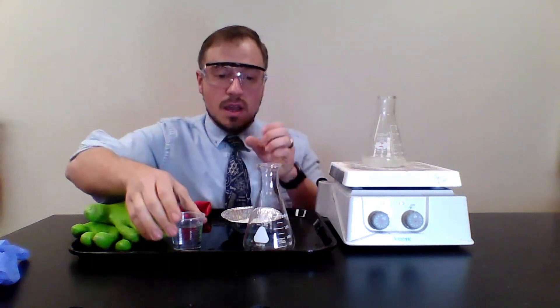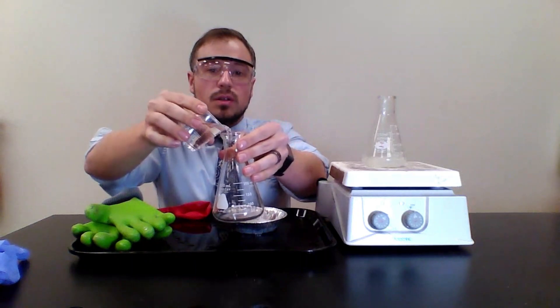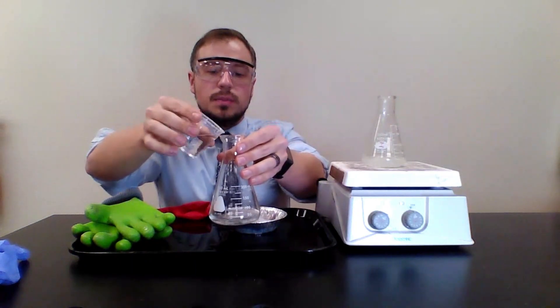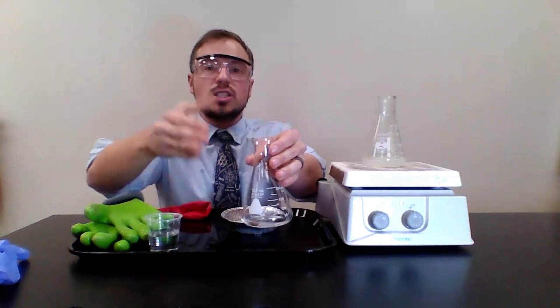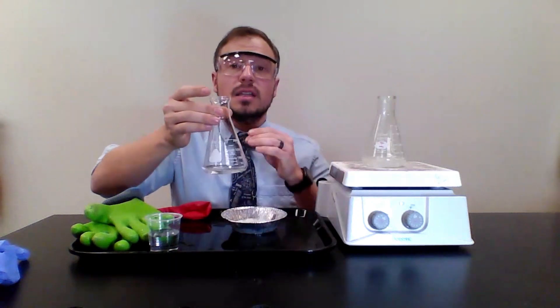First step: turn on your hot plate up to 10, as hot as it'll go. Then take a little bit of water and pour it into the Erlenmeyer flask — just a little bit at the bottom. You don't want too much because we want it to boil.